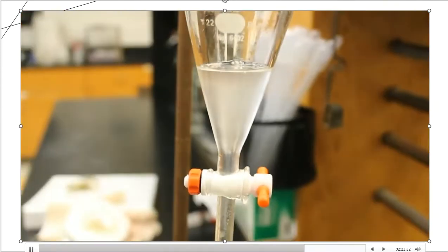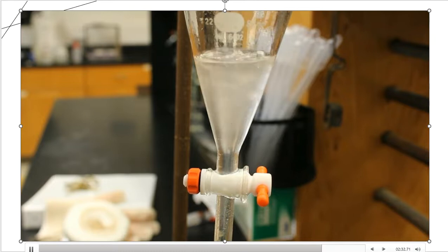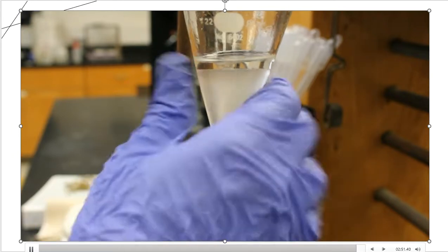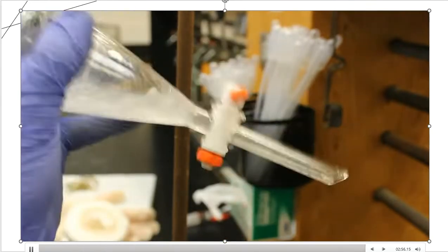And when I do that, the next step, I need to add saturated sodium chloride. So again, 5 milliliters worth. I'll pour the saturated sodium chloride into the separatory funnel. Saturated just means add salt until it no longer dissolves in solution. And then take 5 mils, basically what we used, and add it to the separatory funnel with the methylene chloride. All right, so I'm going to put the lid back on the separatory funnel, and now I'm going to shake and repeat.